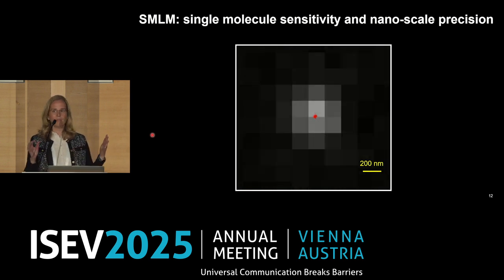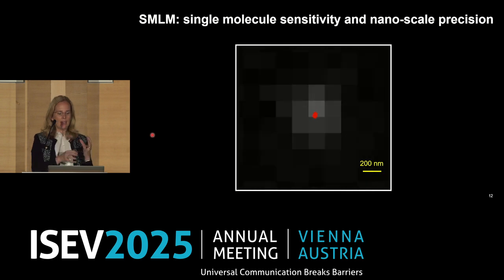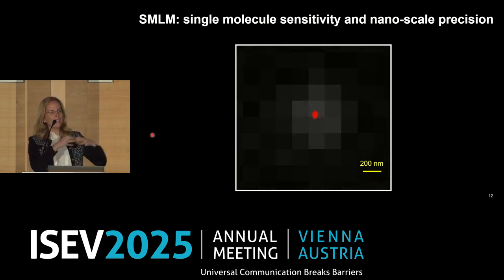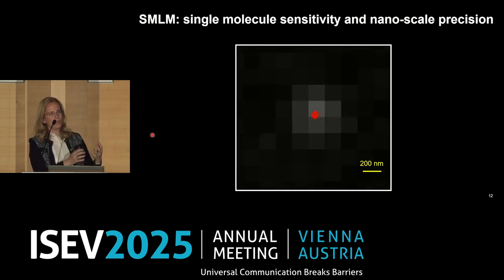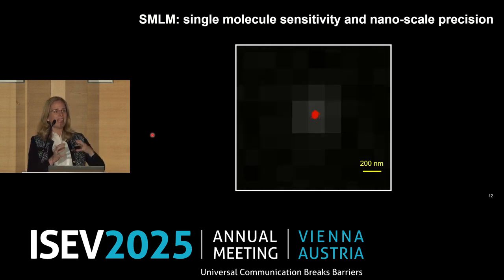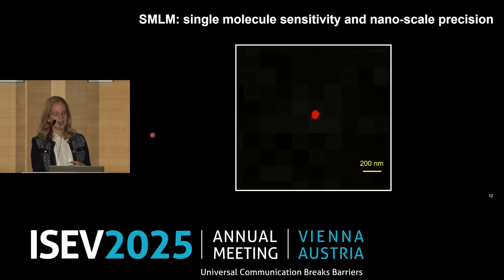This is a single vesicle, right? I'm giving you a little movie of how we image vesicles. Molecules are activated, they turn on and off several times, and then they compose these pictures because we add frames together, right? So it takes quite a bit of time to image that one vesicle that we care about. And it's never boring. It's always this molecular firework that gets me excited.